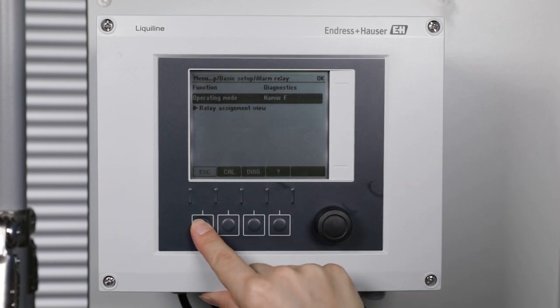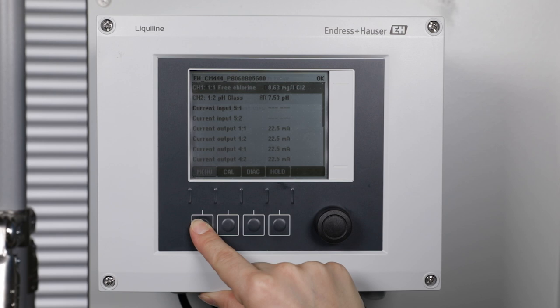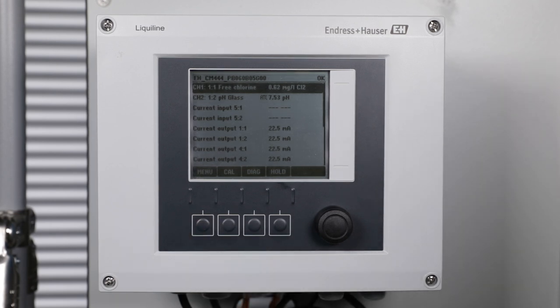So when using the alarm relay, it's no longer available for other messages. And if you are using for example the 2R or 4R module, the settings differ and therefore please find the respective settings in the operating manual of your CYA27 assembly.